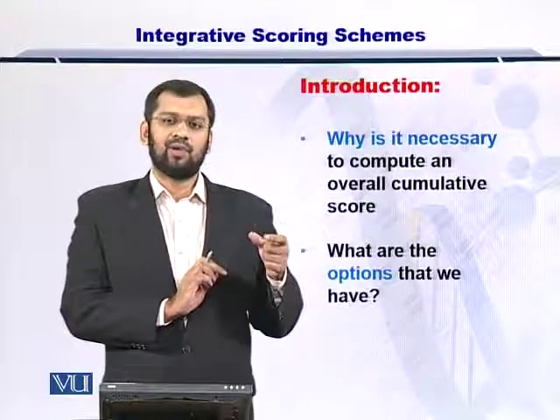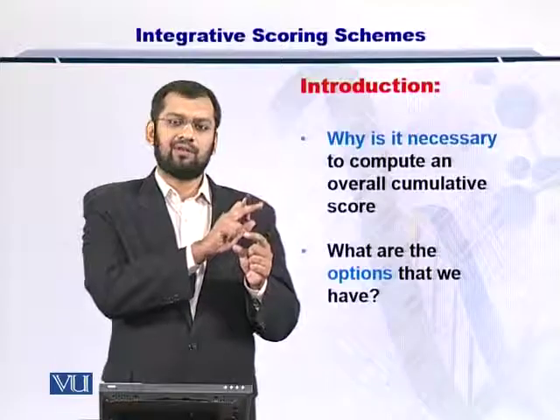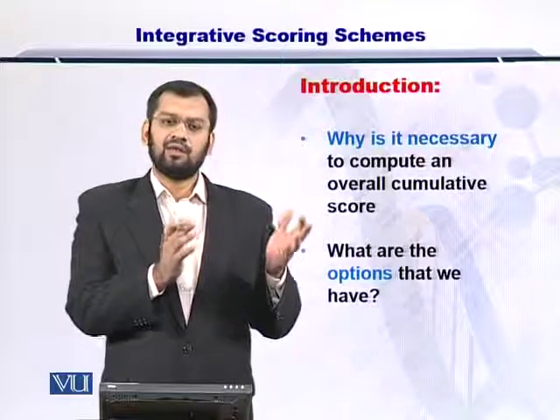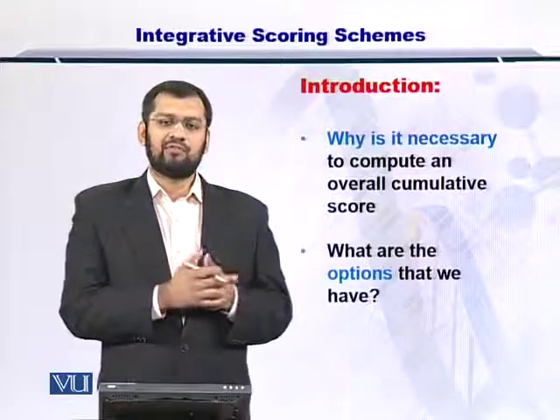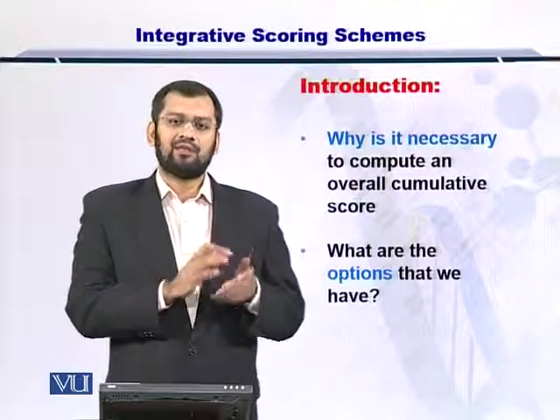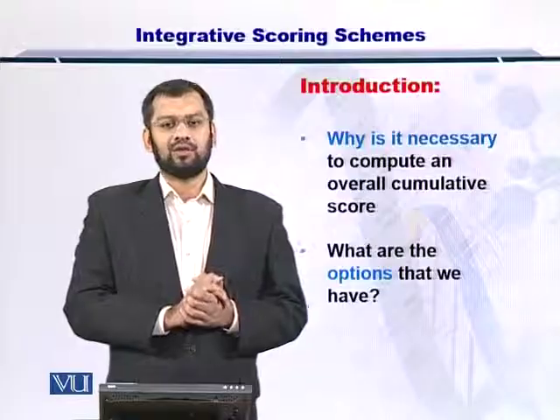Score from the molecular weight will just tell you how close the experimental MS1 is to the candidate protein's mass from the database. So this can be a number ranging between a very small decimal fraction or a very large number.